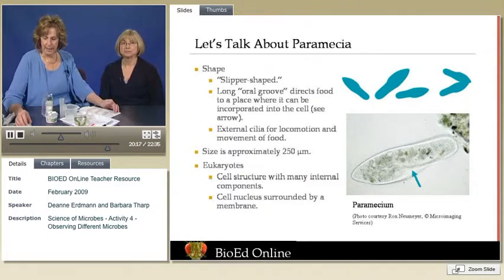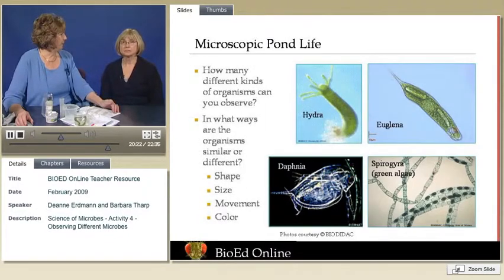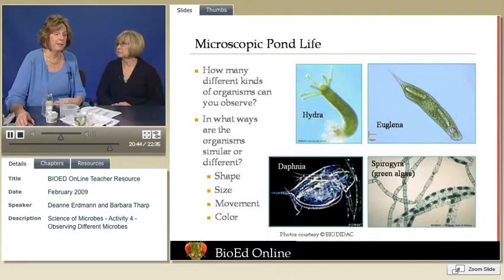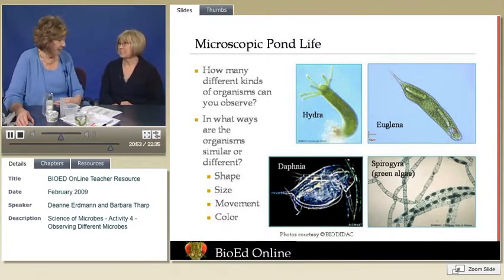Definitely. And again, the type of cells are eukaryotic cells. So, for an extension, something that I think is a lot of fun, this is a great time to look at some pond water. We talked about bringing that in at the beginning, and letting students make a number of different slides and look around to see what kind of microorganisms they could find in there. Now, they're going to find things other than just microorganisms. They're going to find larvae of multicelled invertebrates like Daphnia. Mosquito larvae are very exciting.